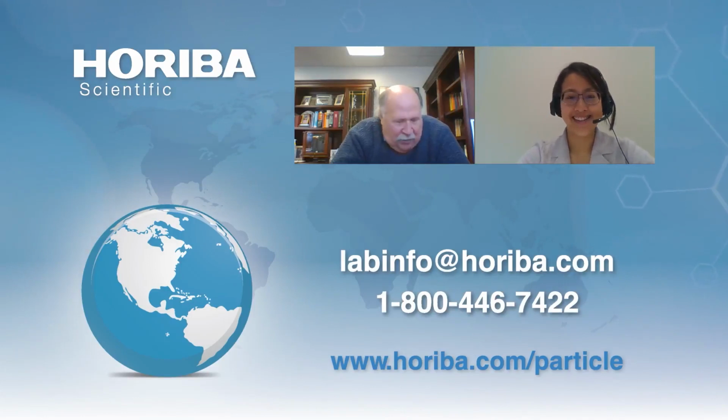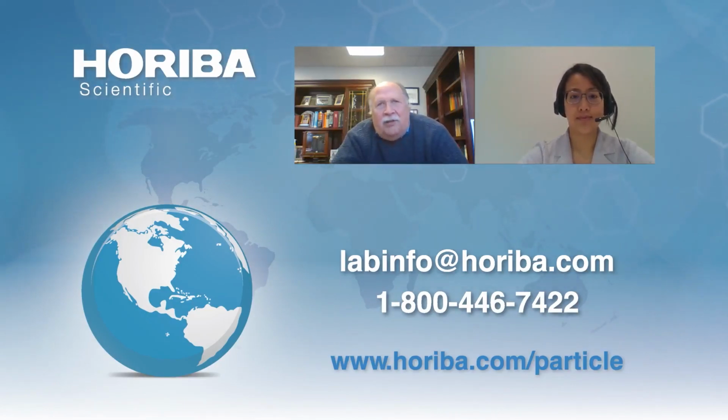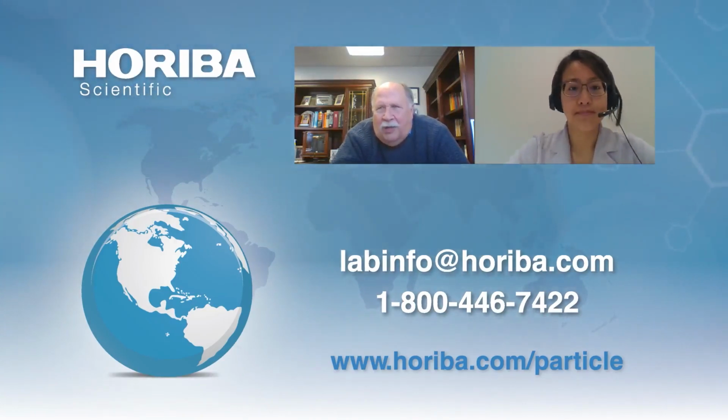I think you can do some powder flow measurements, some Jenike shear cell to try to see what's going on. Obviously, the FT4 is a method that you can put some high shear into. I think you would actually go to some powder rheology, but I'm thinking of a high shear granulator. Do you really have it? Maybe from just a practical standpoint, are you getting granules? That's maybe not what you want to hear, but that's a great question, and I'm stumped right from the start.